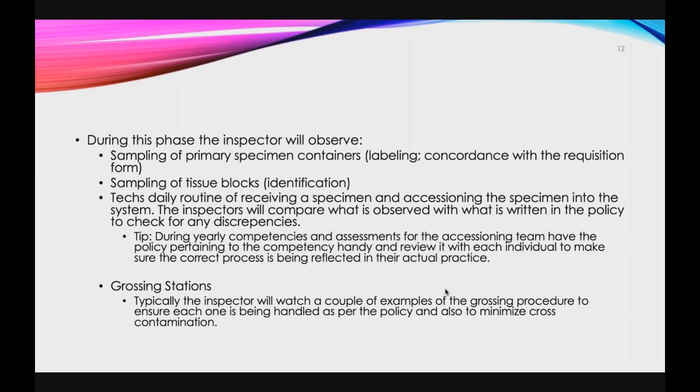The grossing stations. Typically, the inspectors will watch maybe a couple of examples of how the grossing technicians or residents, or whoever you have grossing, handle grossing procedure to ensure each one is being handled as per the policy and also to minimize cross-contamination.